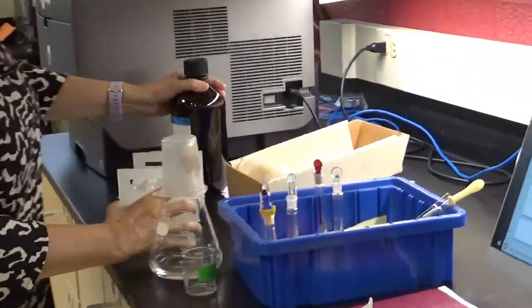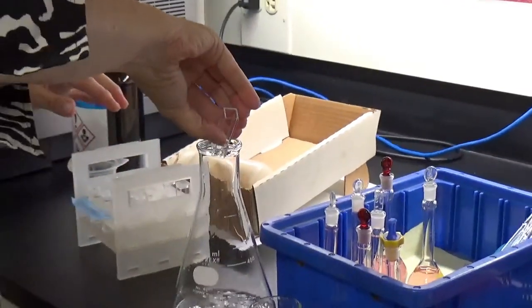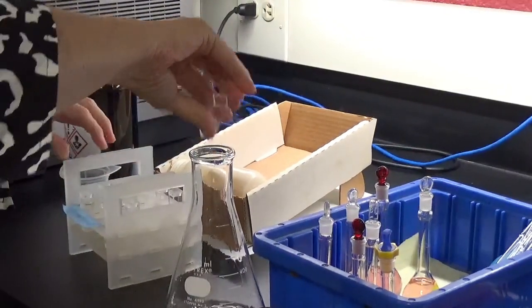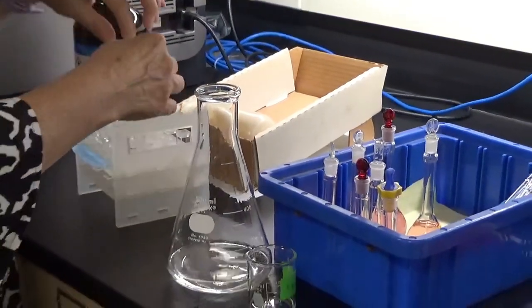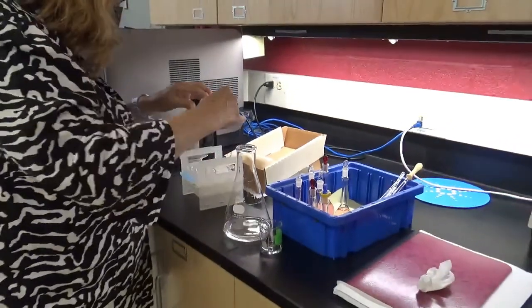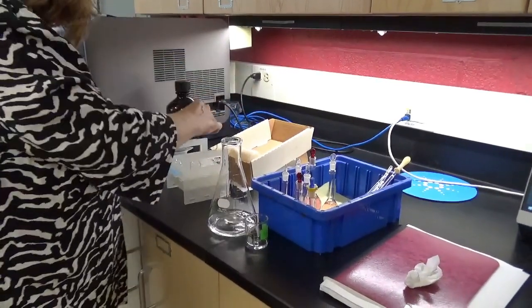Now I'm going to fill the cyclohexane into the waste. I try to hold these by the corners or by the top, but I'm kind of in a hurry.